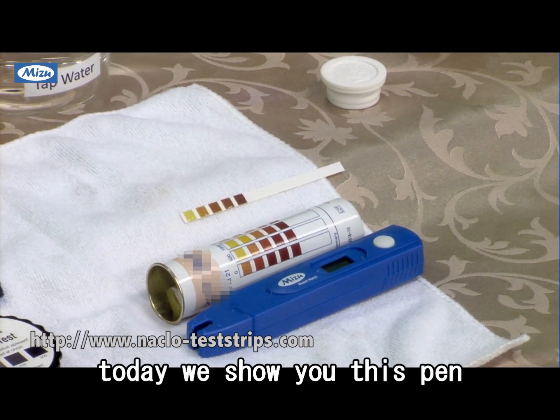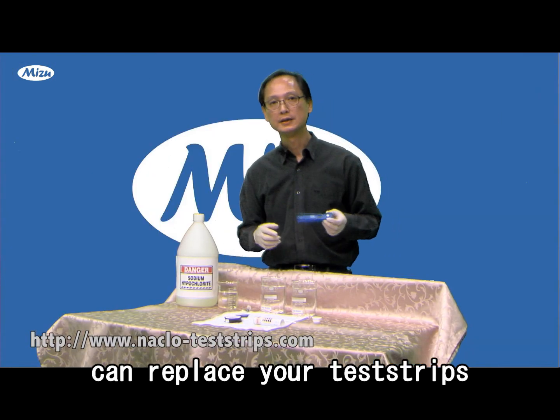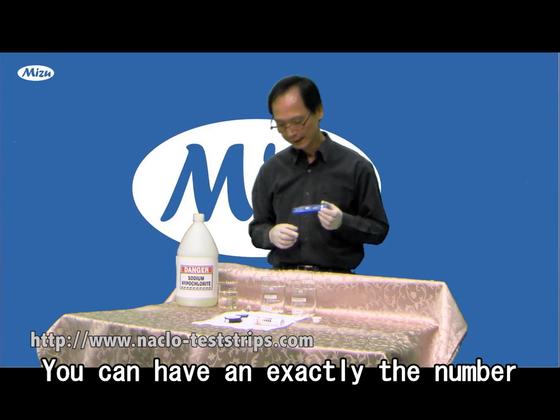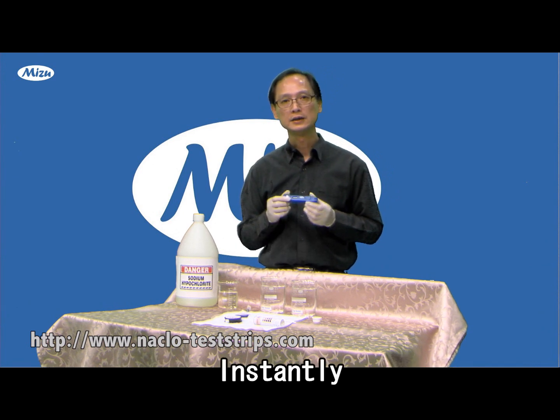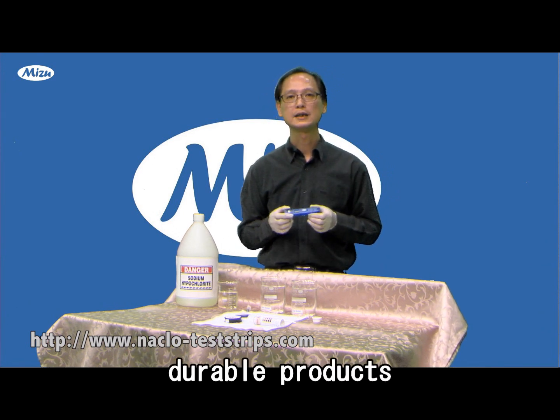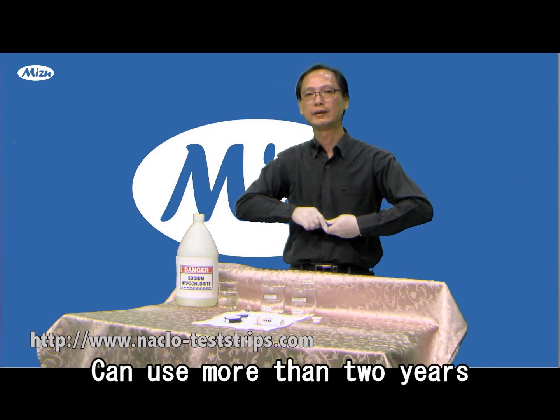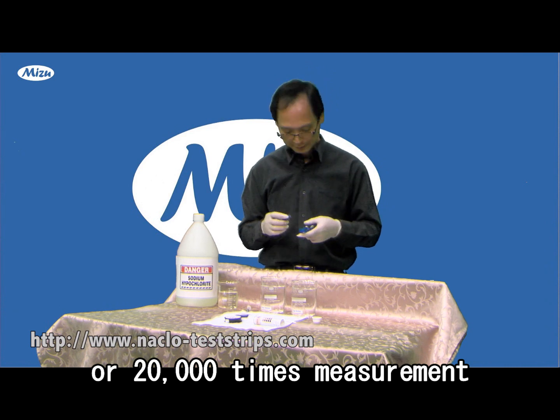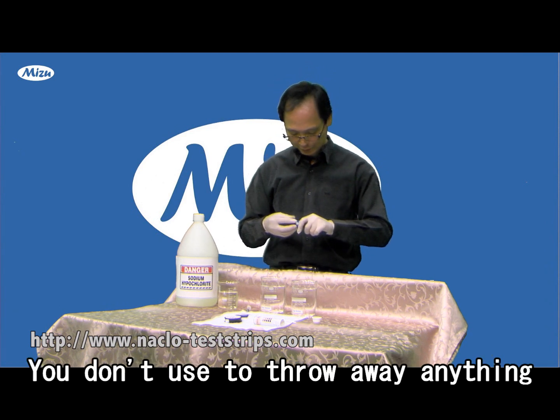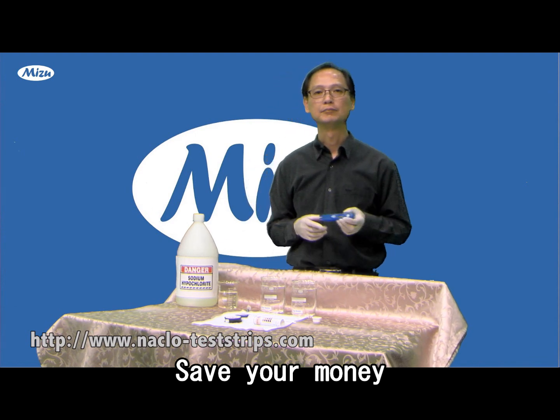So today we showed you that this pen can replace your test strips, and you can have exactly the number, instantly. It's a durable product — you can use one battery for more than two years, or 20,000 measurements. And you don't need to throw anything away, which saves your money. Thank you.